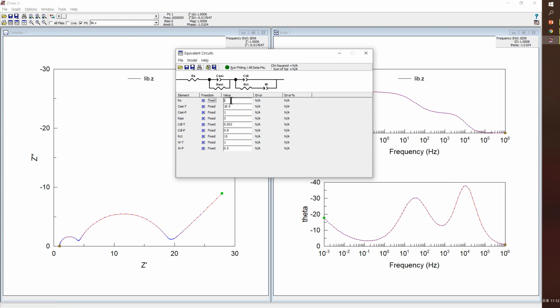Also, forget the right answer. Okay, just remove some values. 0, 0, 0, 0, 0, 0, 0, 0. And then fixed means we cannot change the value. So click it, and free plus means this value should be positive.